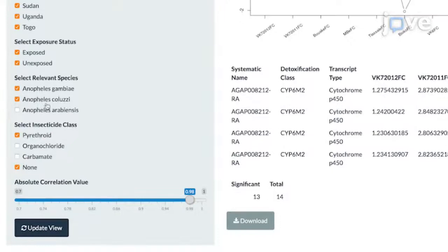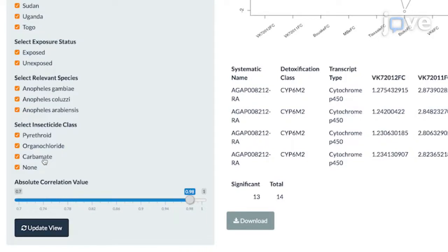Select the datasets to interrogate by ticking the relevant boxes for countries, including exposure status, species of interest, and insecticide class of interest. Ensure that these criteria result in greater than one included dataset.